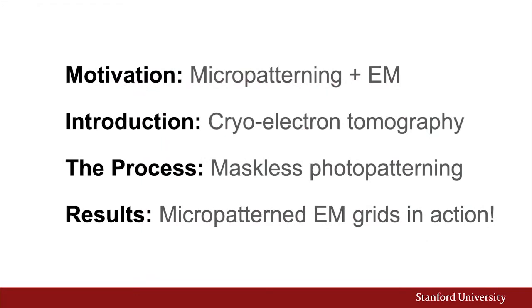I'll start out by providing the motivation for combining protein micropatterning with electron microscopy. I'll give a brief introduction to the rapidly developing field of cellular cryo-electron tomography. I'll describe in detail the maskless photopatterning process that we've used to micropattern substrates for cryo-ET called EM grids. Finally, we'll have a look at our micropatterned EM grids in action.